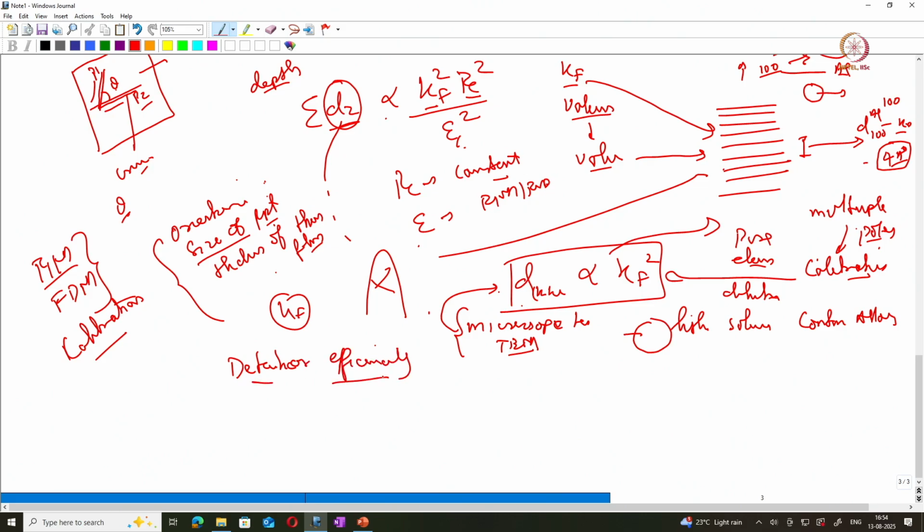Which is a very important factor. Detector efficiency is related to the number of ions detected relative to the number of ions which get ionized or field evaporated. Not all the atoms get detected at the detector, because some of them are lost to the environment. They will strike the solid areas of the MCP plates and strike back, so they will not enter those glass tubes. So there will be a certain detector efficiency, and this can also be estimated by the crystallographic direction.